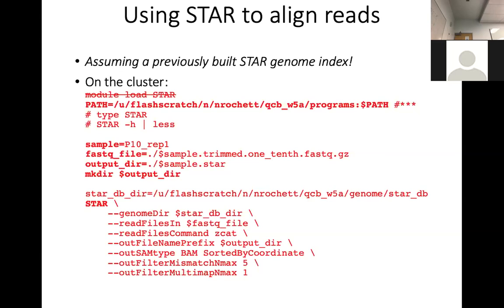So first of all, seeing this first, it's okay. But it's basically ignoring that command.